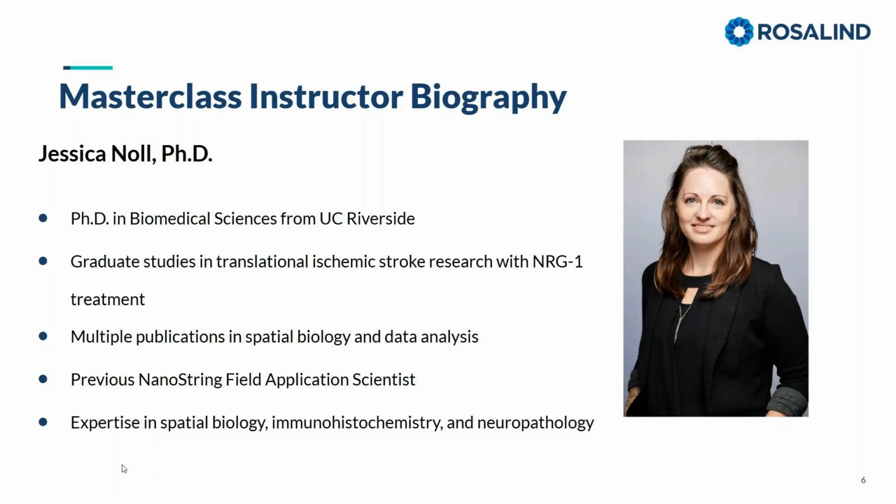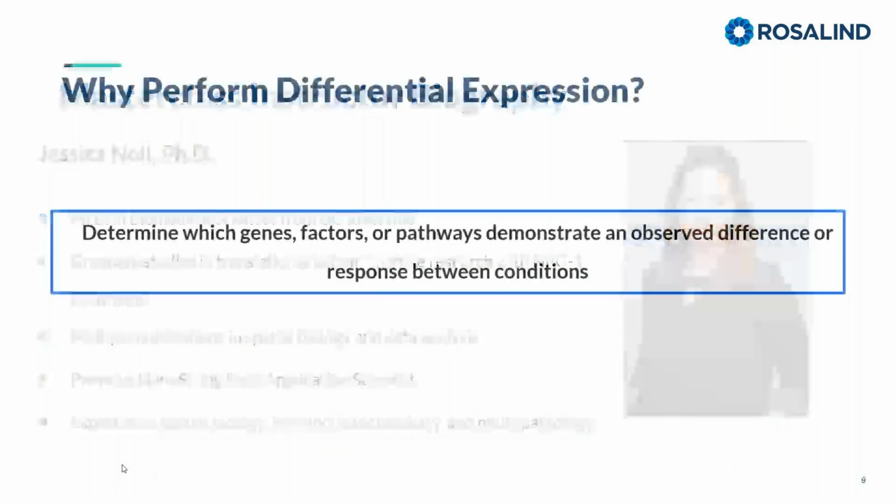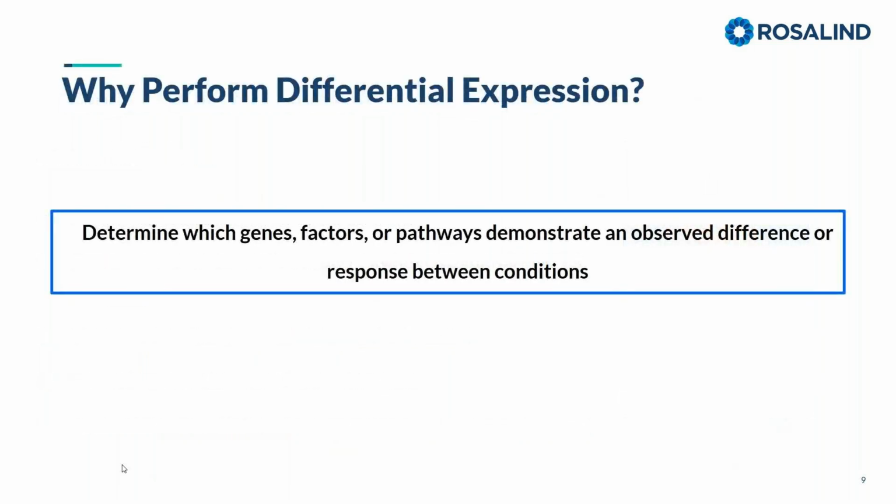And so I'm really excited to have helped build this pipeline with Rosalind and bringing this masterclass to you all with tips and tricks from my own research, as well as working with countless researchers in various different fields as my work as a FAS at NanoString. And so I'm really excited to be helping you and sharing this knowledge across these different steps with GeoMx WTA analysis. And today we're finally talking about differential expression.